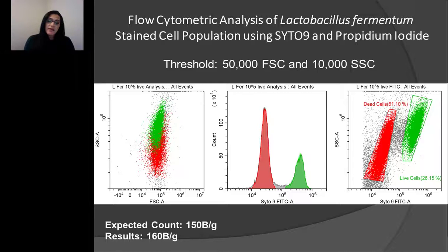And these counts were at the beginning, this is just preliminary data when we started running the samples, but we definitely were able to find the 2 populations and also obtain this nice graph with a histogram, and that confirmed for us that this was the bacterial population we were looking for.